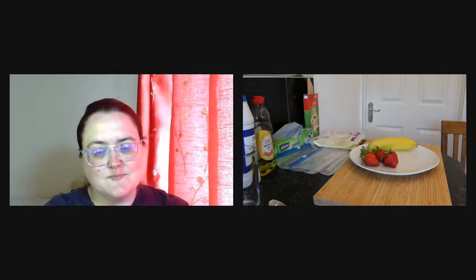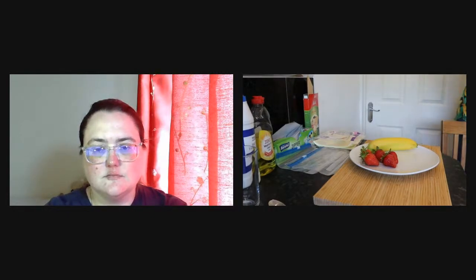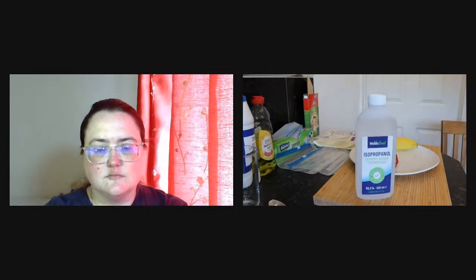Okay, but I think you've forgotten something, Remy. What else do you need? Yes, indeed, I have forgotten something, and I need to go to my freezer for this. There is a very important thing that we need that is in my freezer, and it's going to be isopropyl alcohol. This is a cleaning product that you can buy online. It is necessary that you have isopropyl alcohol for that genomic DNA extraction.